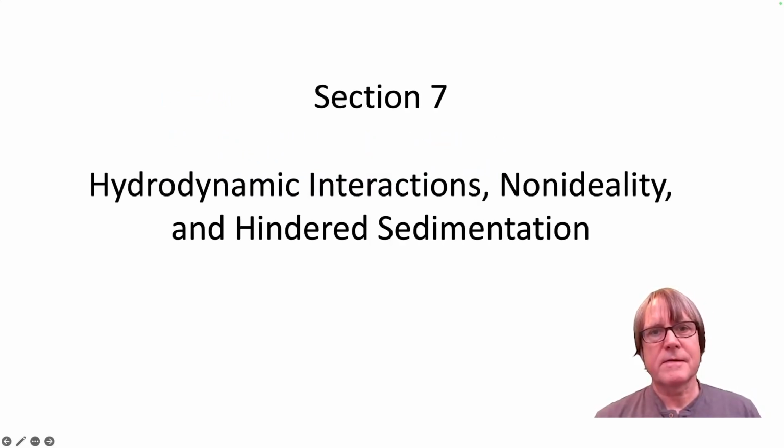The last segment of this video deals with the unavoidable physical interactions between macromolecules that are based on the fact that they occupy finite volume and are sedimenting in viscous solvents. Now, these interactions will scale with the total concentration and as such will be particularly relevant when we investigate weak interactions which require high total protein concentrations.